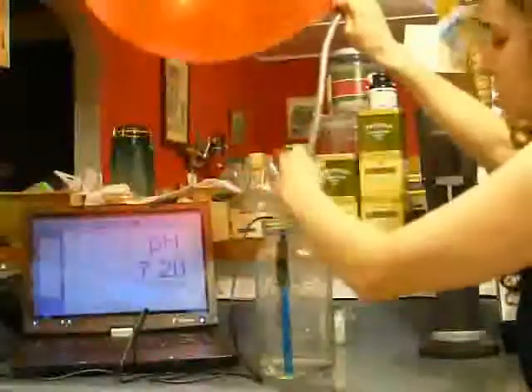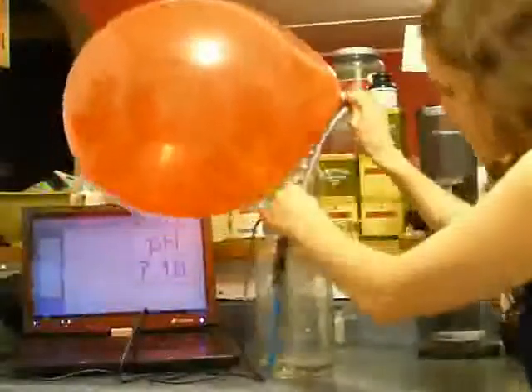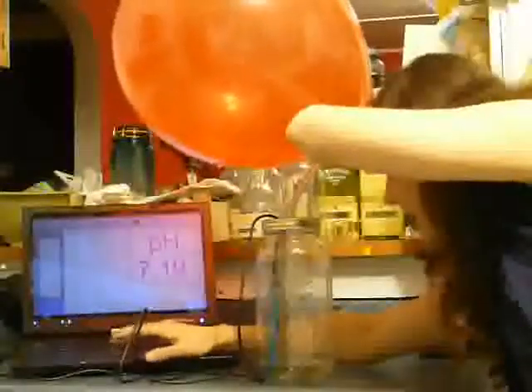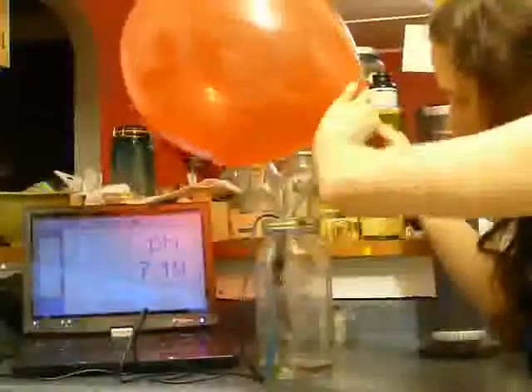And so you can see now the benefit of doing this as a group project, because your lab partners could be blowing these up as I was collecting data. So I'm going to tell this to collect again. Append the latest. And here we go. Let's see if we can get anything worse.